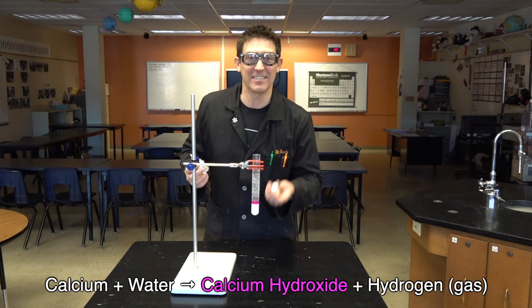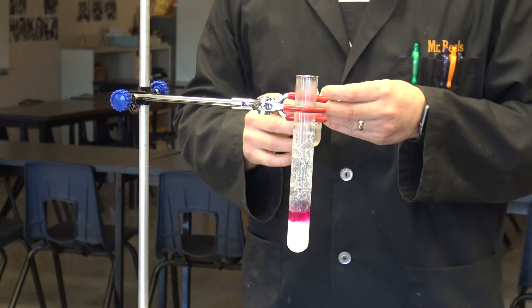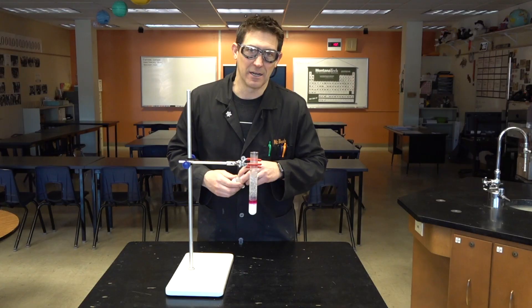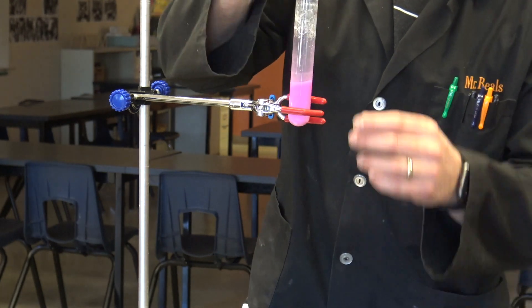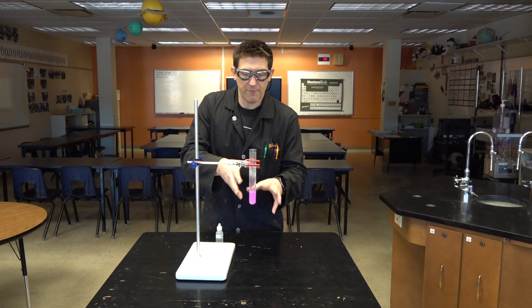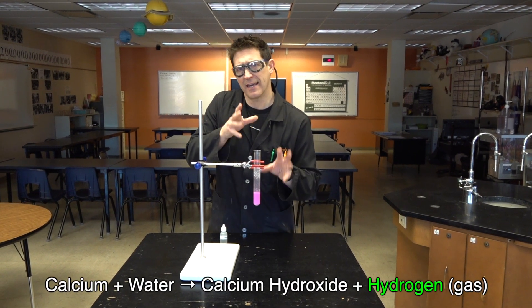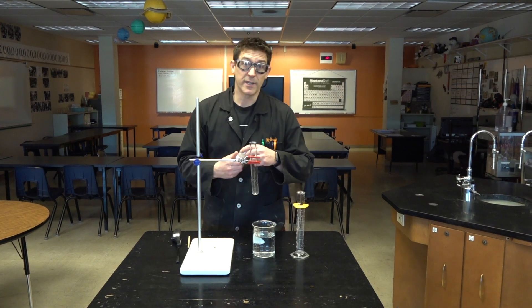Now you're starting to see why I like to do this on Valentine's Day because all the colors are Valentine's-y. This is a very basic solution — the opposite of acidic. So this is nice, but if we're producing hydrogen gas, that hydrogen gas should be flammable. Let's look at this again.